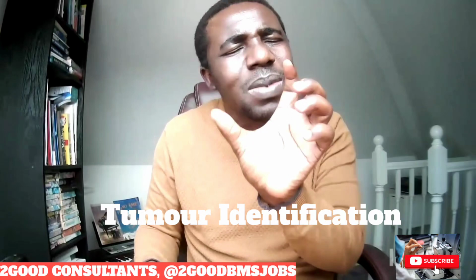So in addition to the diagnosis of conditions of the gastrointestinal tract, it can also help in the diagnosis of conditions associated with what? The respiratory tract. Does that make sense? In addition to that, this ABPAS can also help with identification of tumors.